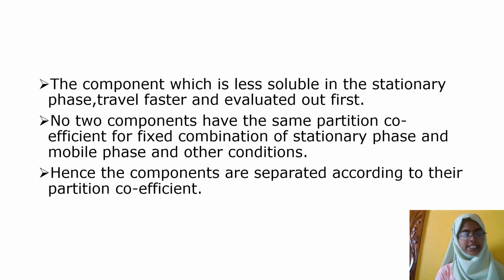The component which is less soluble in the stationary phase travels faster and is eluted first. No two components have the same partition coefficient for a fixed combination of stationary phase, mobile phase and other conditions. Hence, the components are separated according to their partition coefficient.